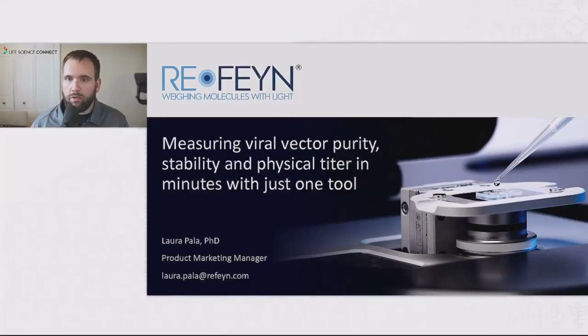Accurately characterizing large viral vectors is indispensable for ensuring the safety, stability, and efficacy of viral vector-based gene therapies and vaccines. However, characterization methods are often time-consuming, requiring multiple orthogonal techniques. I'm Miles Skoda. This is the Life Science Connect webinar series, and today we're talking about measuring viral vector purity, stability, and physical titer in minutes with just one tool.